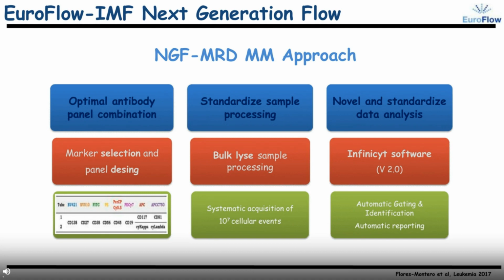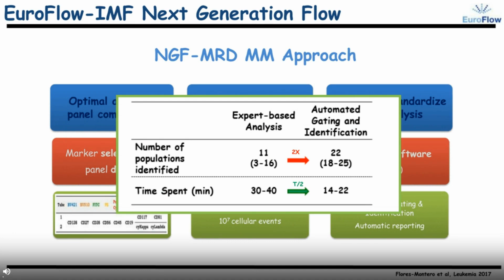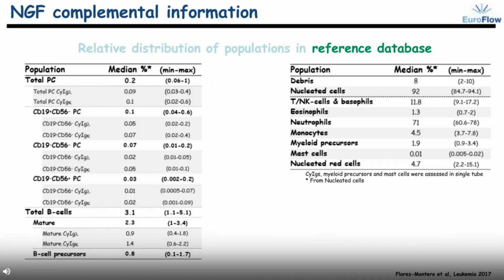At the same time, we get an efficient answer on the principal question, that is, whether the patient is MRD positive or negative, based on the complementary analysis strategies and tools. We double the amount of information obtained from each sample, and we optimize the analysis time. Thus, the analysis intrinsically contains complementary information that we are all starting to observe and to establish their clinical value.